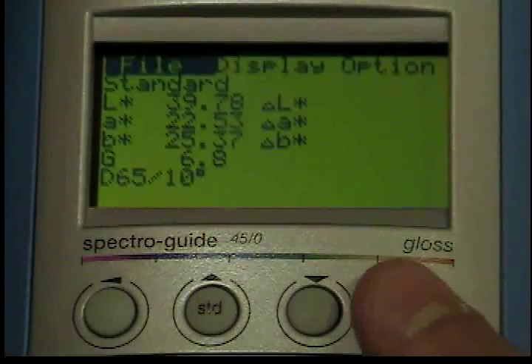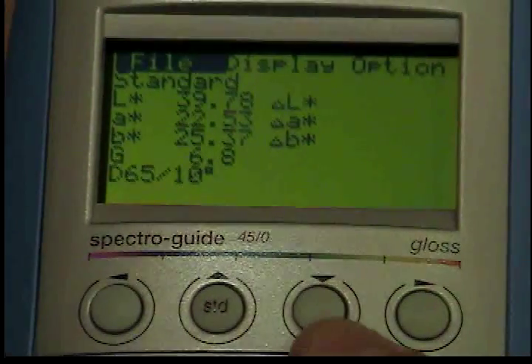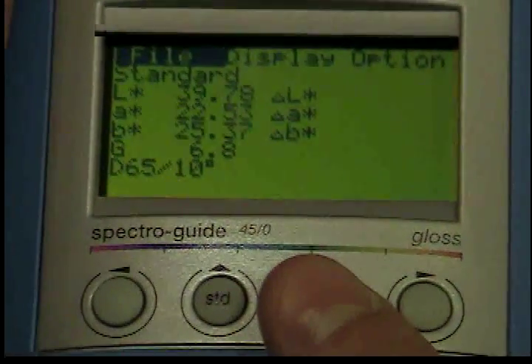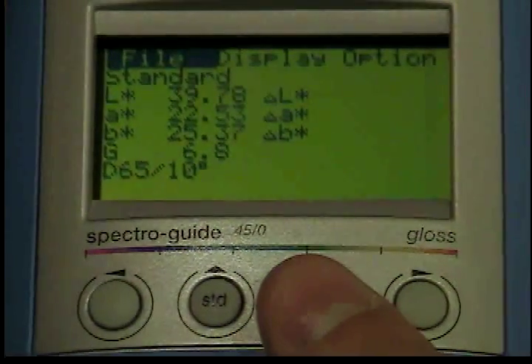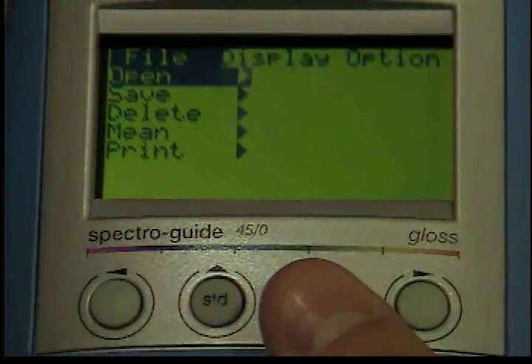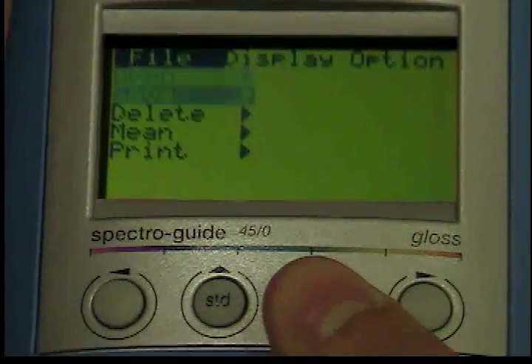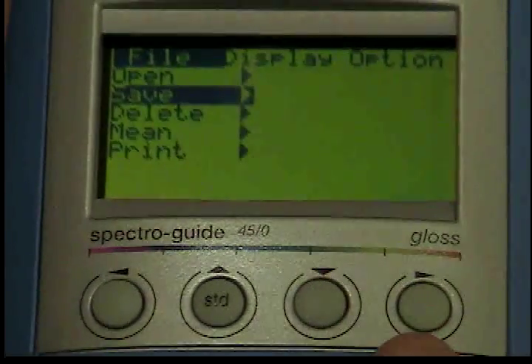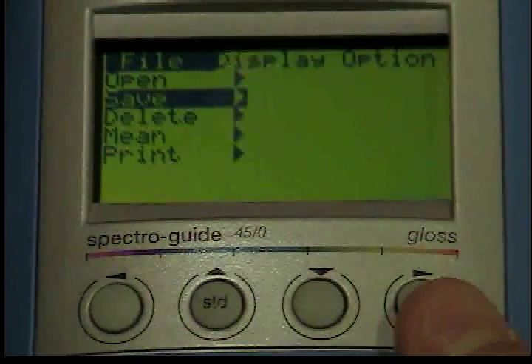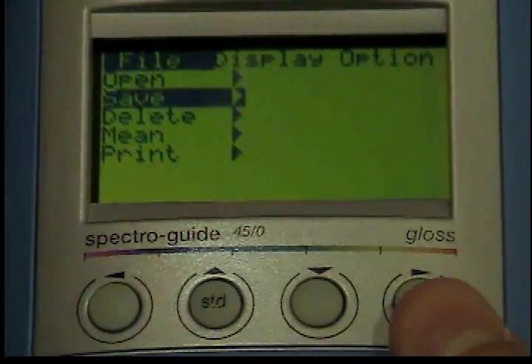To store the last measurement, use the down button from the file menu to move the cursor to the save option. The submenu opens when you press the operate button.